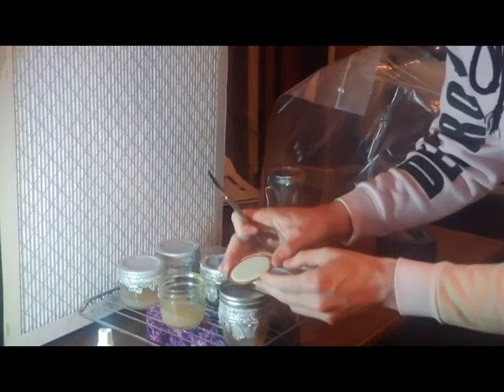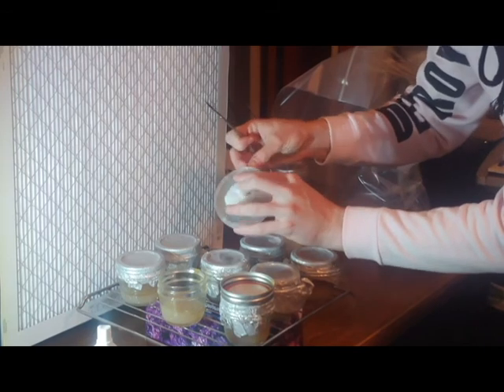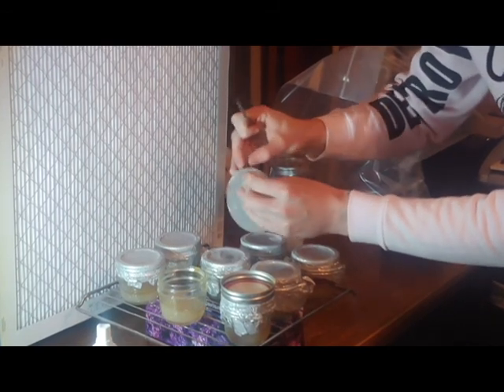Right here I'm using a scalpel. Some people like to flame sterilize, but right now I'm using alcohol because alcohol is readily available.